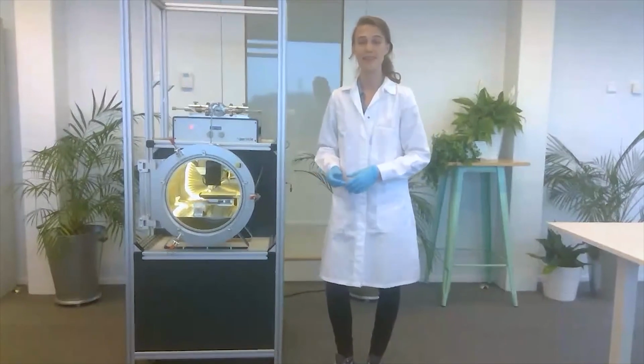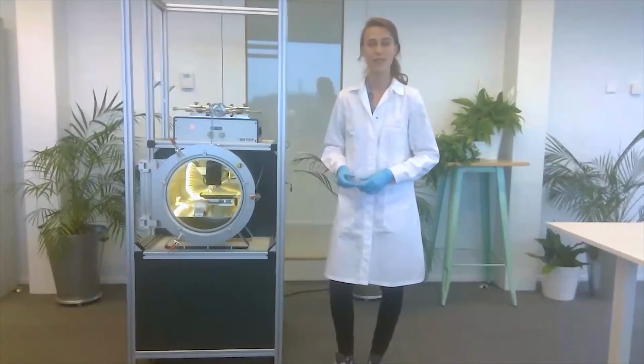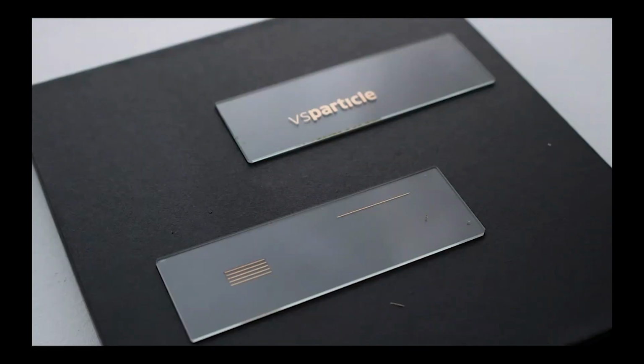I will now give you back to Pauline, who will show some more examples. So here you see two patterns that we printed. You see the different line thicknesses and widths and our logo that is printed.